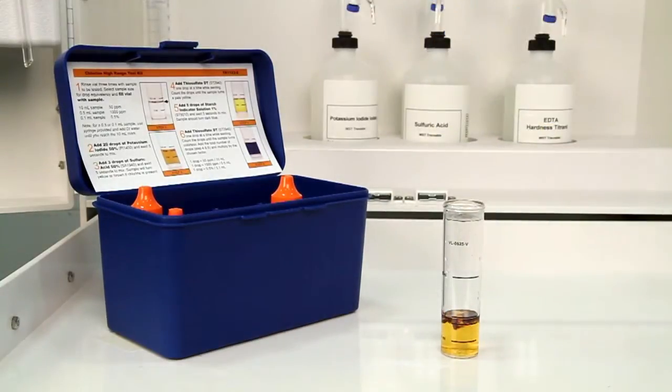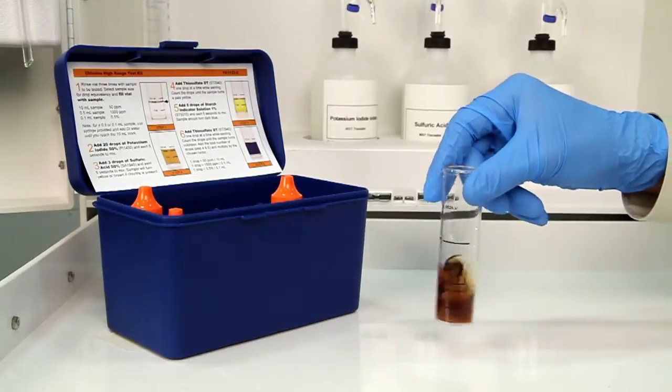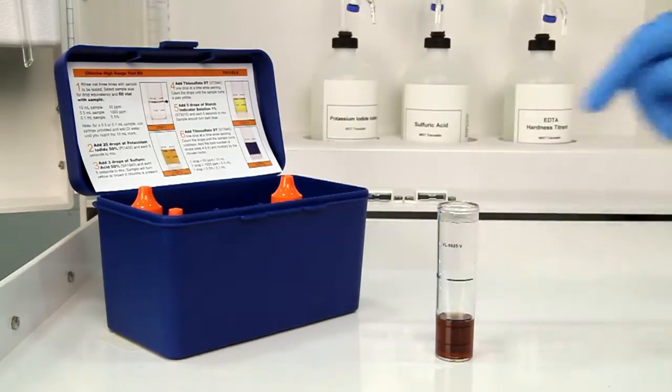After the addition of each reagent, swirl the vial five seconds to make sure the reagents are properly mixed. The sample should turn dark blue.